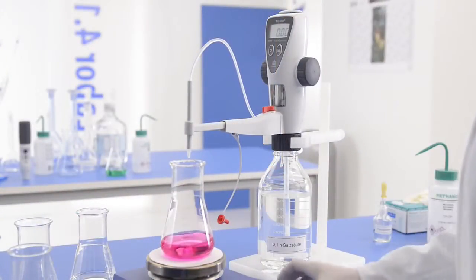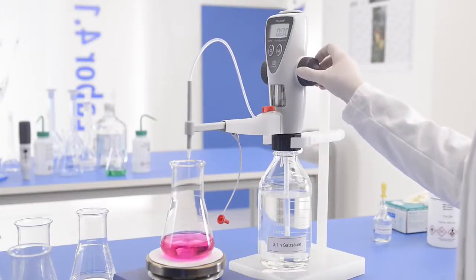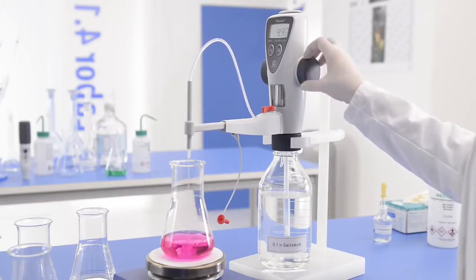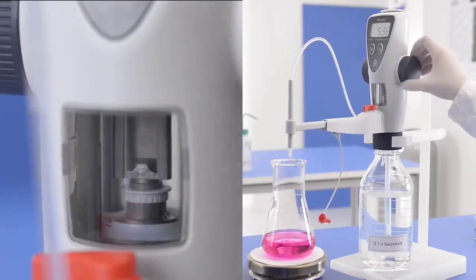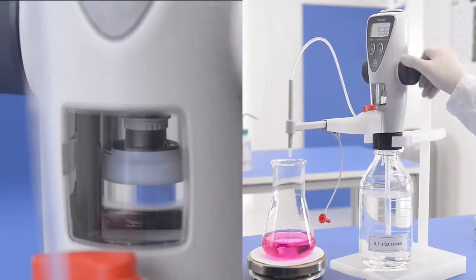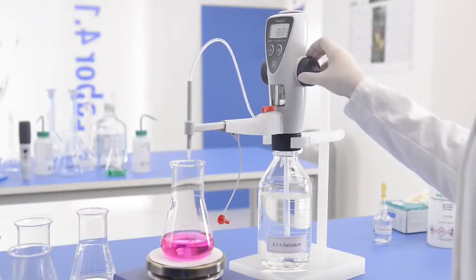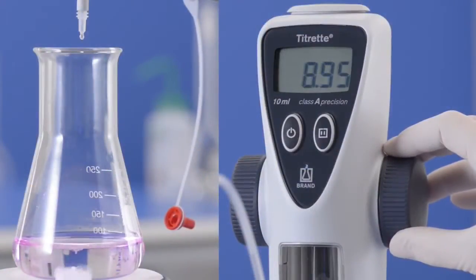If the titration is started without a full refill, as shown here, the piston may reach the stop before the end point. In this case, simply raise the piston for filling. The display value will remain fixed during the filling process. The titration can continue as usual, drop by drop, with the highest possible precision.